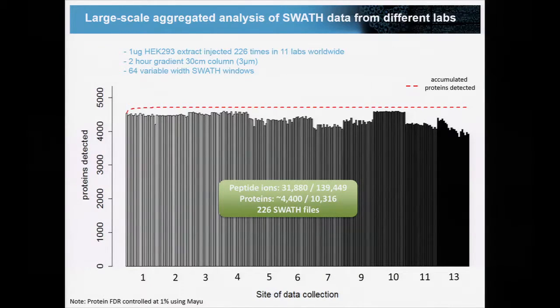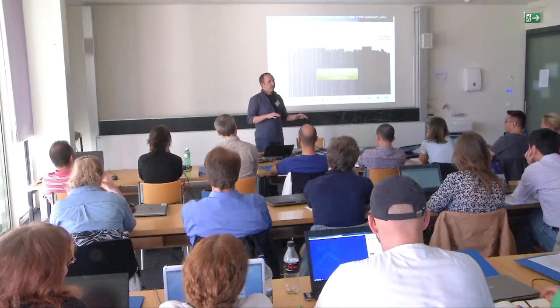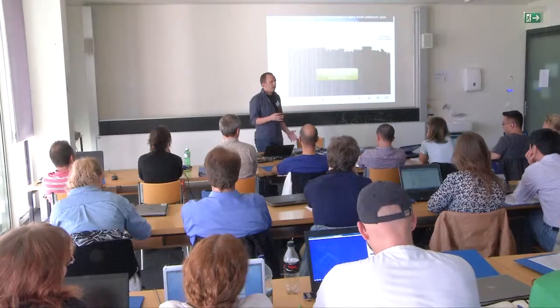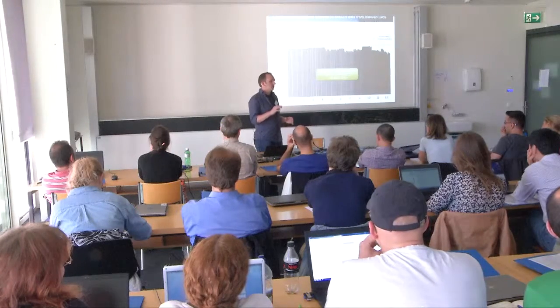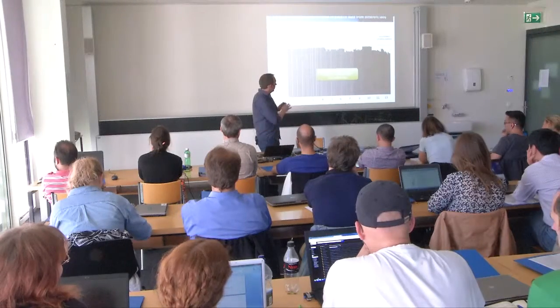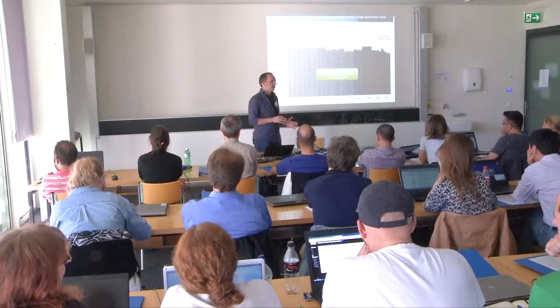Another thing I would point out, though, is that all this data was analyzed centrally, mostly by me, actually. If we let everyone do the data analysis locally, I think you would run into more problems. There would probably be more heterogeneity if we said to everybody, just analyze the data and do the best you can, then it would look pretty heterogeneous, and I think you would need to standardize that data analysis as well. But the first iteration of this was to just try and do the measurements everywhere and see how that impacts things.